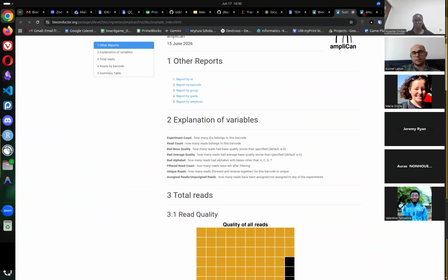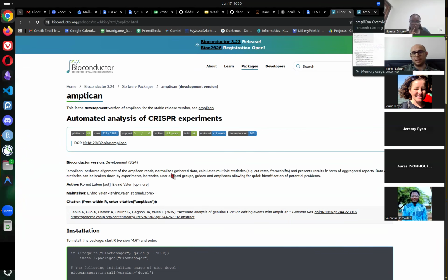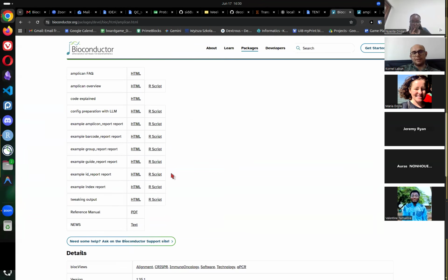It is, for example, in the ID report. It also loads events, and you can see how to do operations on them. This is just a table, and then you can start making very customized normalization for yourself. I think this is the only way to deal with such problems.